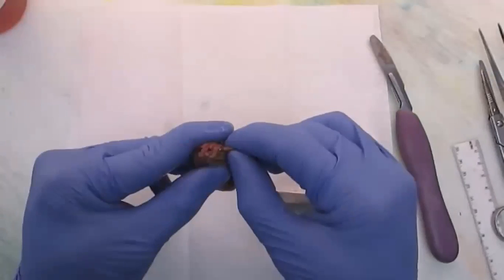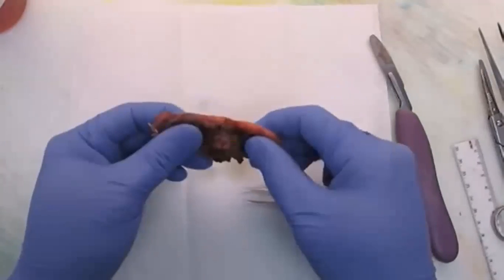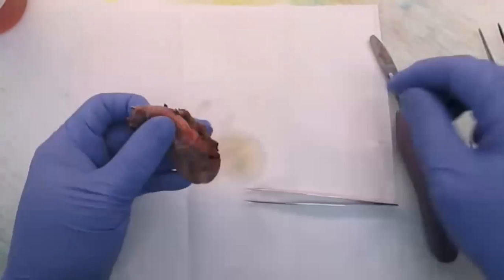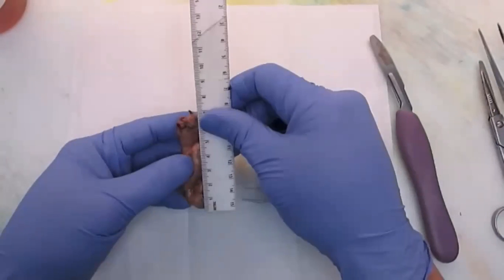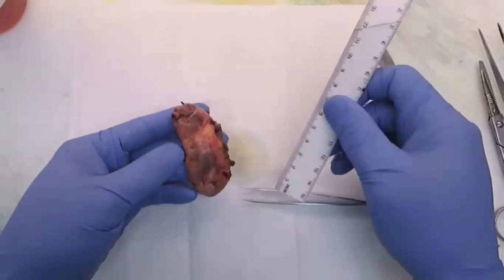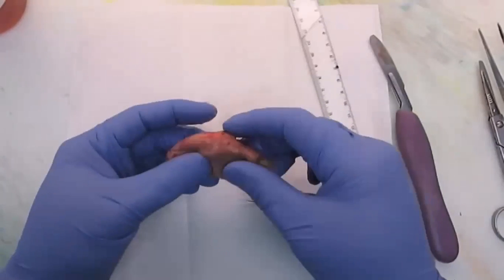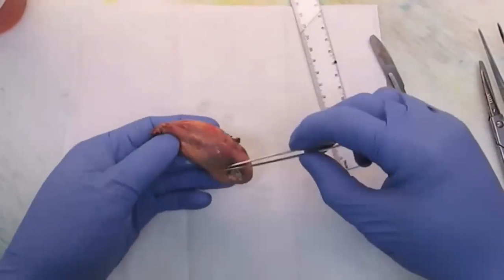First, we're going to talk about whether it's received intact or not. So please take note of the parameters that we will use for describing the specimen. In length, number one is the dimension. Open it and measure its circumference. And then we're going to talk, like with any organ, describe from the outside to the inside.